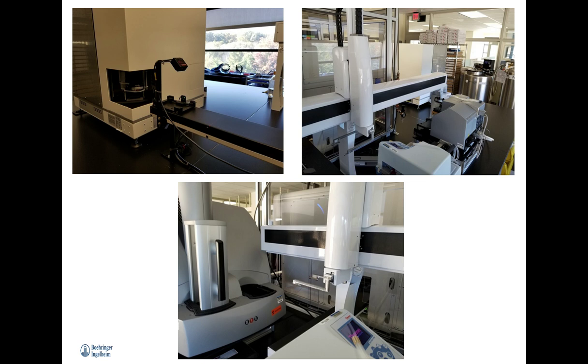We do have, as you can see, an integrated barcode reader in the upper left photo, and in the bottom center, easy access into the MSD. Just as a side note, the MSD reader and any of the components on this system can still be used in an offline fashion. They can be used as individual instruments when the system is not running. So if someone needs to just run an MSD plate, they don't have to feed it into this platform. They can just use the MSD reader as a standalone.